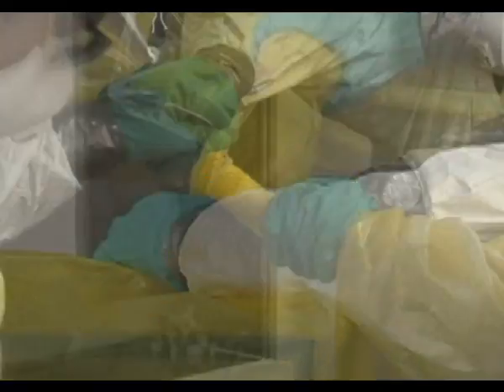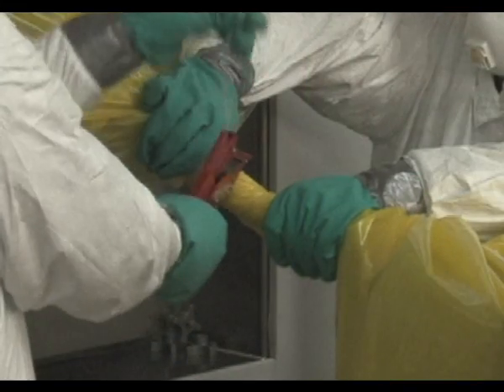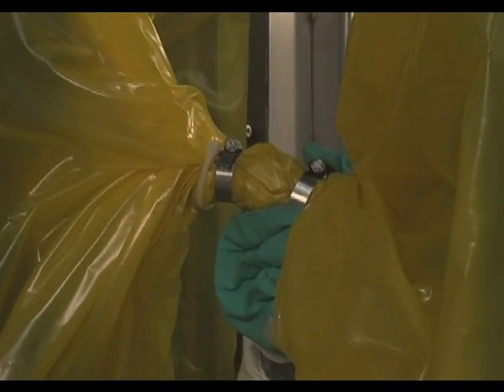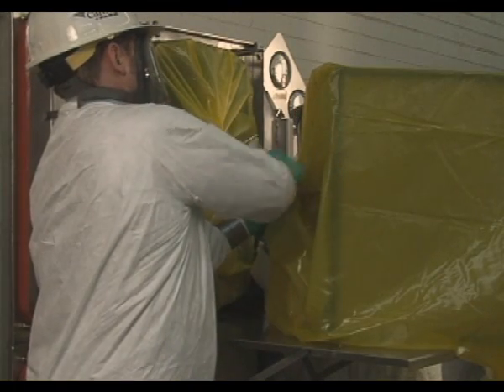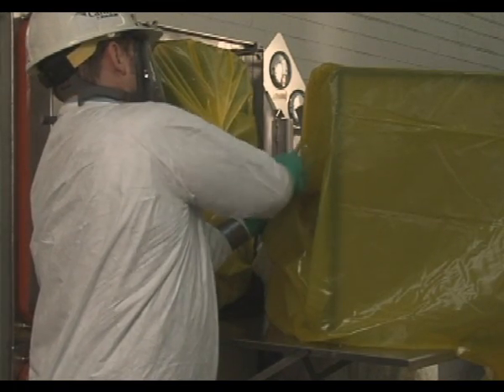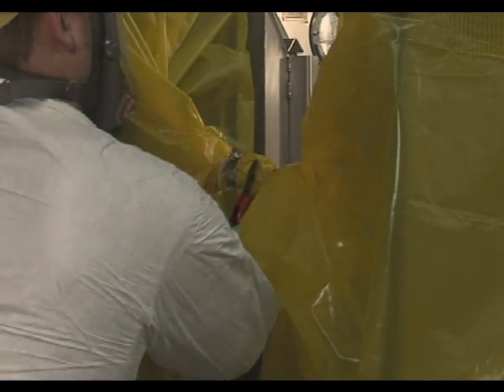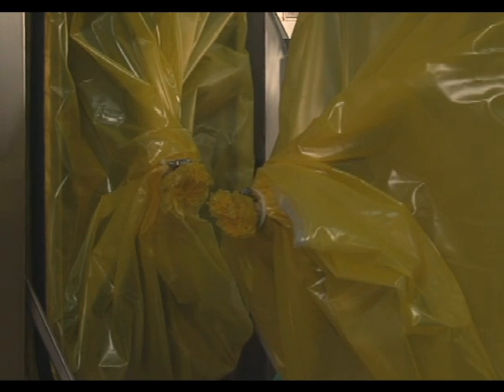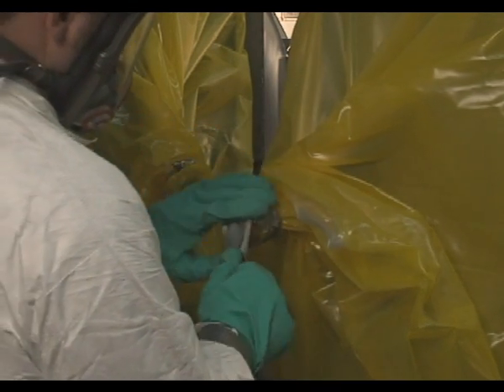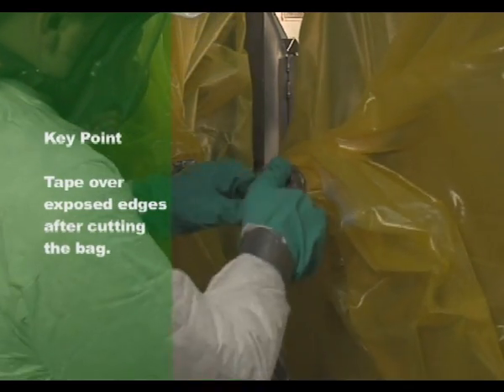Using the materials from the banding kit, tie strap approximately 8 inches of the twisted bag to secure. Place two metal straps around the change out bag, in between the tie straps, and tighten to hold the twisted part of the change out bag securely. Cut completely through the change out bag in the middle of this section, leaving a stub bag on the bagging ring of the housing. Tape over the exposed edges where the bag was cut. Remove the contaminated filter in the bag for disposal.